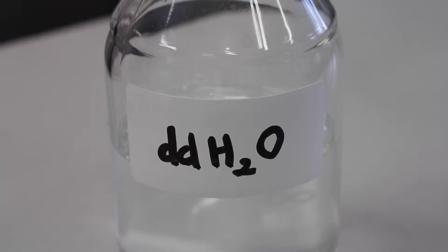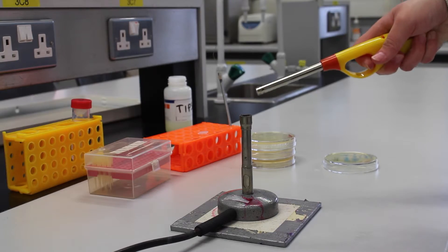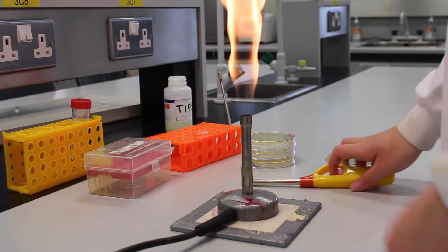Also a petri dish containing colonies and distilled water. The Bunsen burner will provide aseptic conditions to prevent contamination.